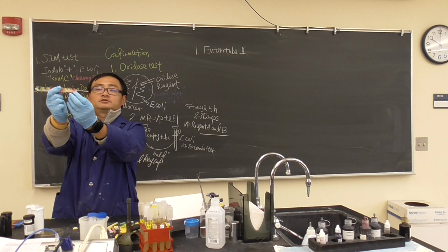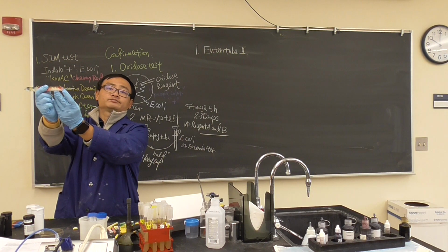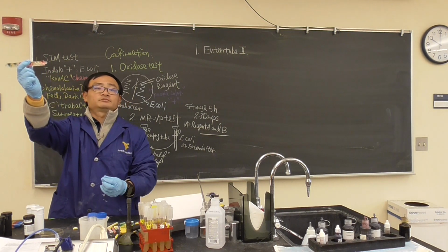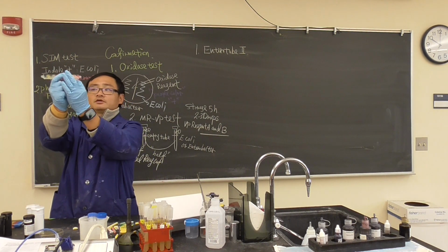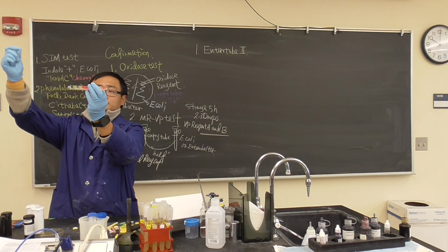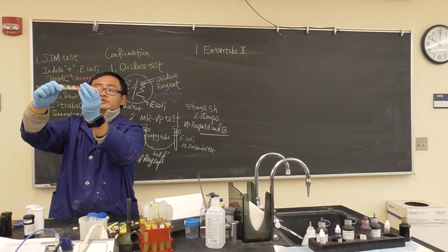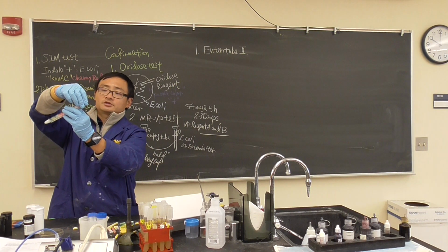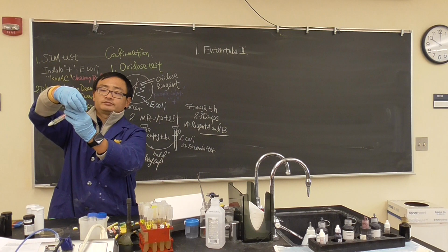Look here, there's a clicker. How do you do it? Bend it. There's a click here, bend it. Once you've done this, you have to close it. Remember, these two caps, you have to hold in your hand. Do not put them on the bench, because otherwise it's contaminated.